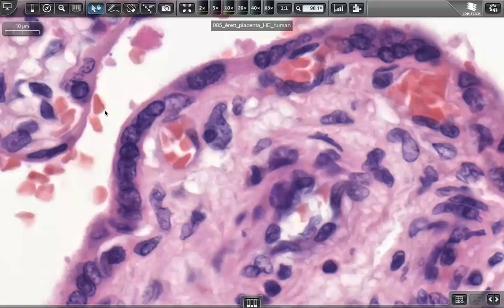Eventually, there's no such a big difference, just the location of the red blood cells. So they belong to the fetal circulation, and the intervillous space having the maternal blood represents the red blood cells of the mother. These are the maternal blood, the space for the maternal blood. Red blood cells here and red blood cells there, just providing gas exchange through the layers of the villus.